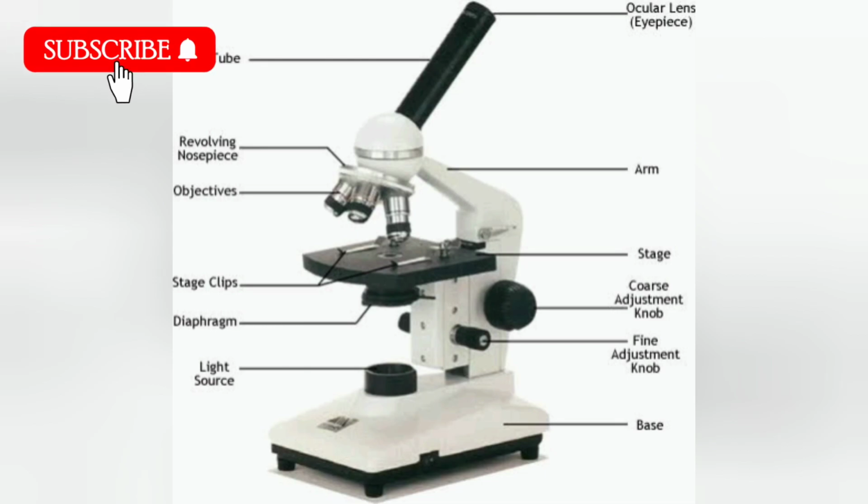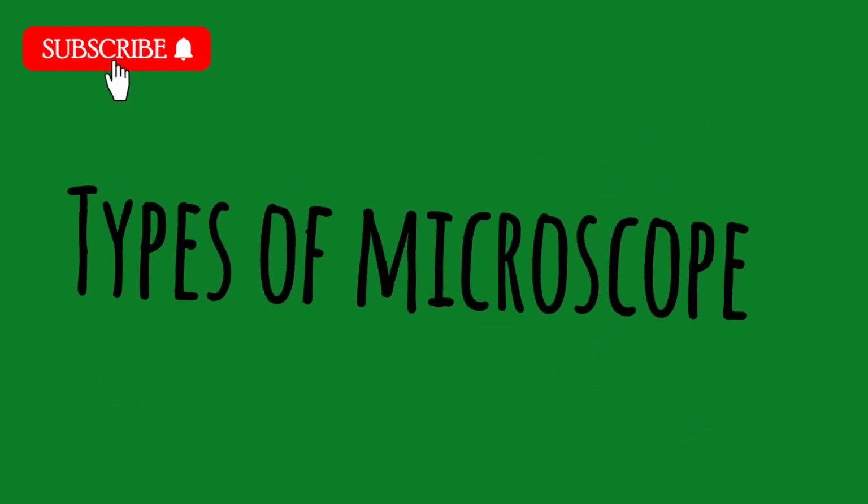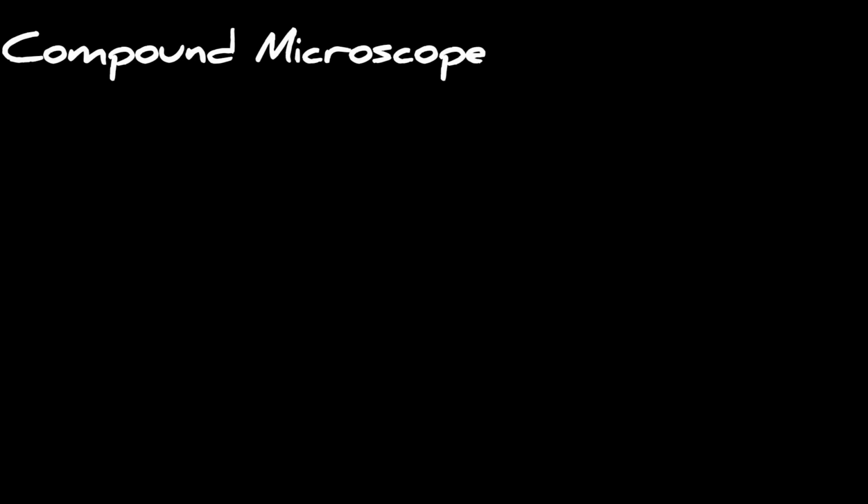So now let's go on to the types of microscope. There are basically 4 types of microscope. There is simple microscope, compound microscope, electron microscope, and stereo microscope. But the two microscopes that are used mostly are the compound microscope and the electron microscope.